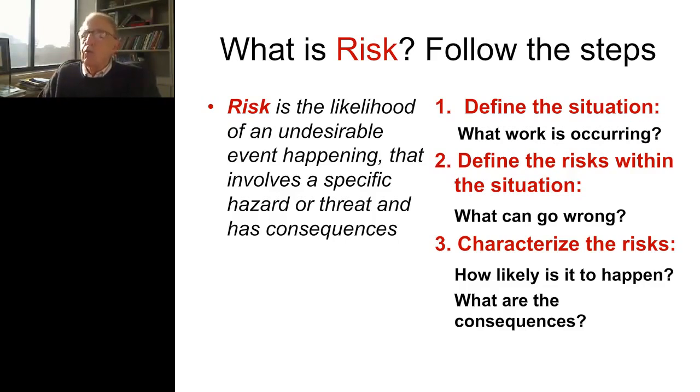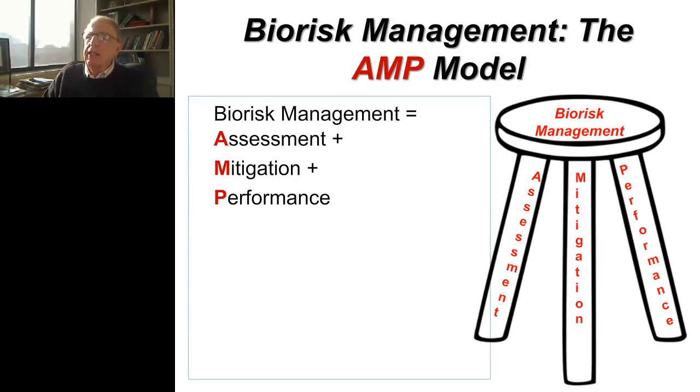So going through a risk assessment process is asking yourself a series of questions. What is occurring with the work? What can go wrong? How likely is it to happen? What are the consequences if the person gets an infection? Is there treatment? Is there not treatment available? So that is the basic questions you ask in the risk assessment.